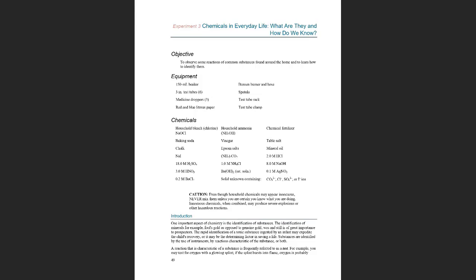So the objective is here, as we just mentioned: observe some reactions of common substances found in everyday life around the home.